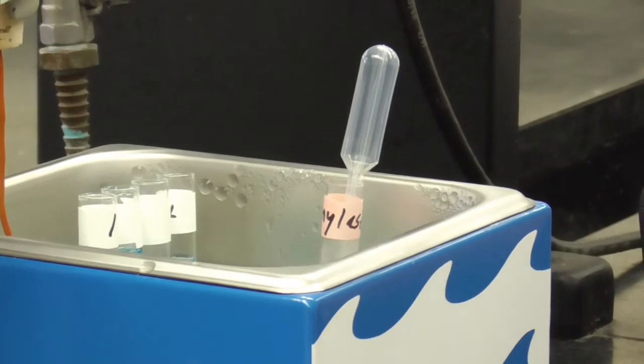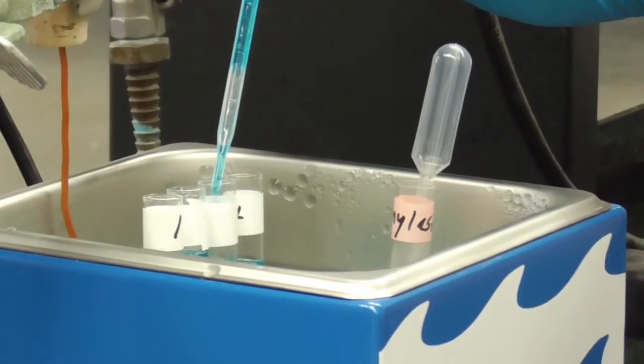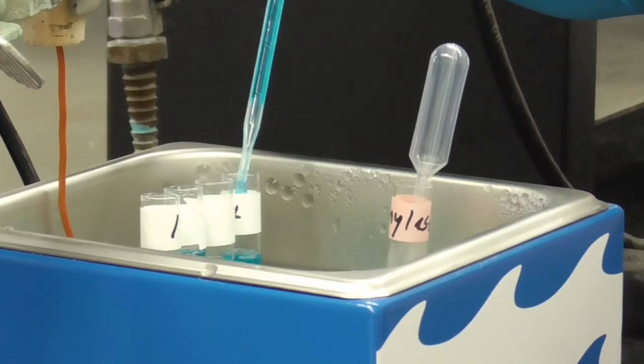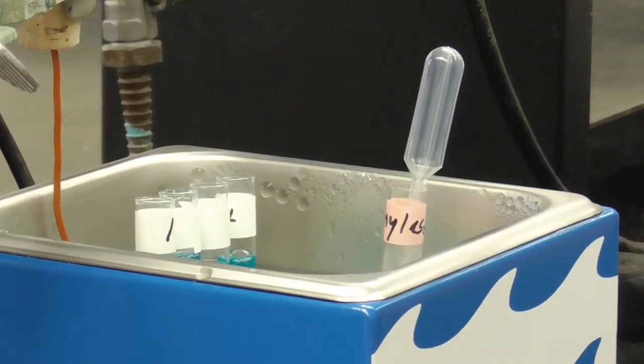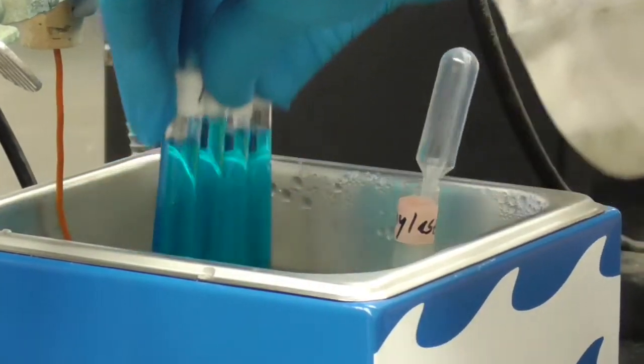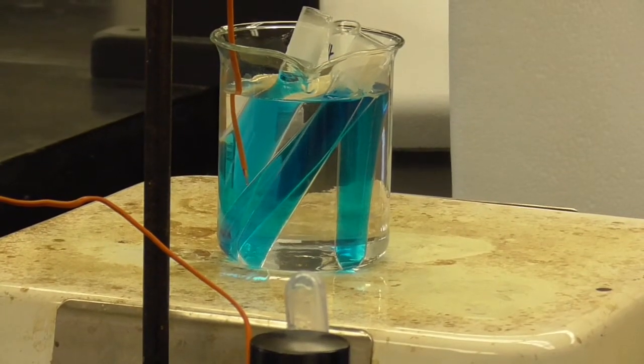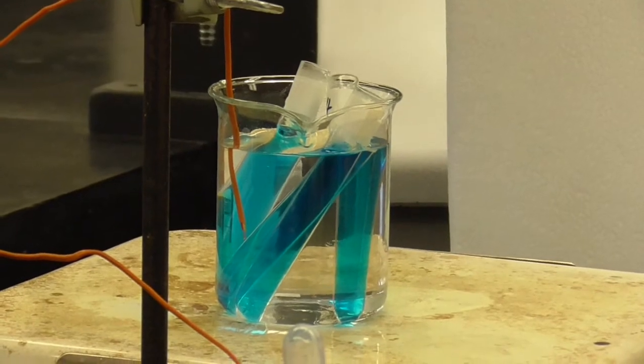2. And I'm going to add just a little bit more of that first test tube. It's a little bit low. Yeah, these are a little low compared to it too. Just to get them about the same. All right, so they're all nice and light blue. Let's transfer them to our boiling water bath here, which is at 100 degrees or just below 100 degrees, and we'll let them sit for about 3 or 4 minutes. So we'll reset the timer and we'll say go.